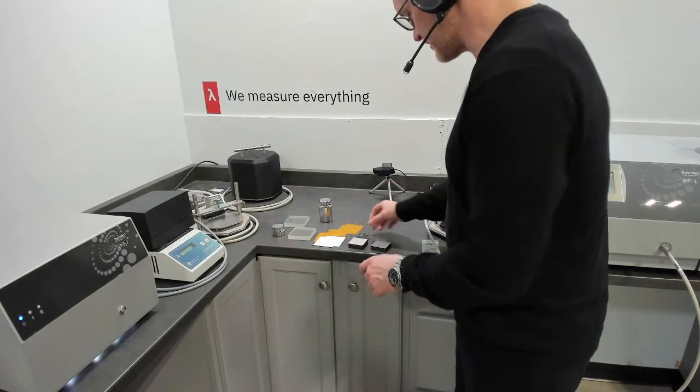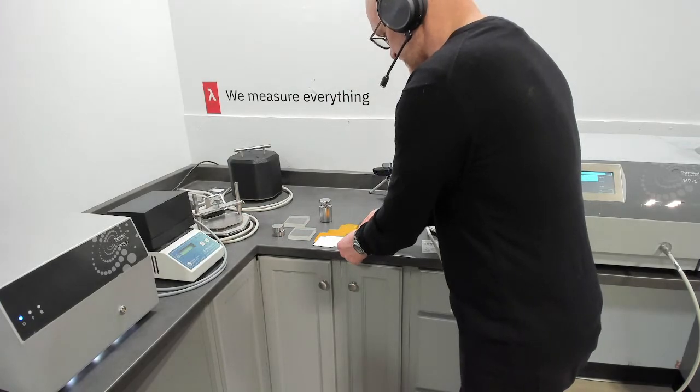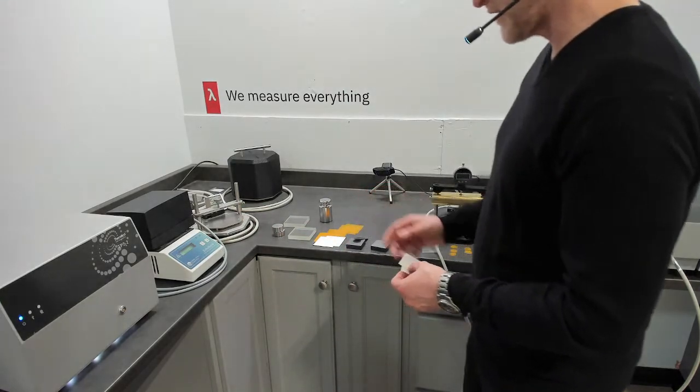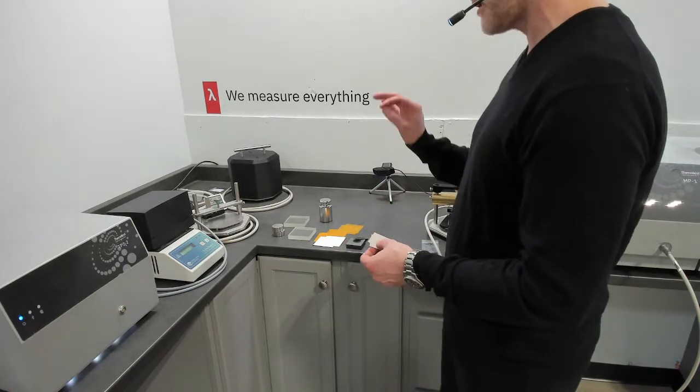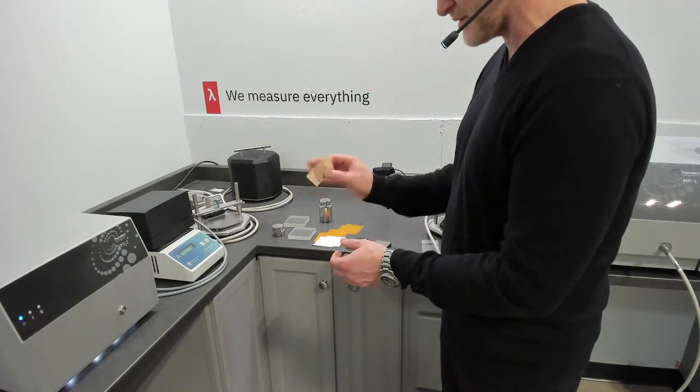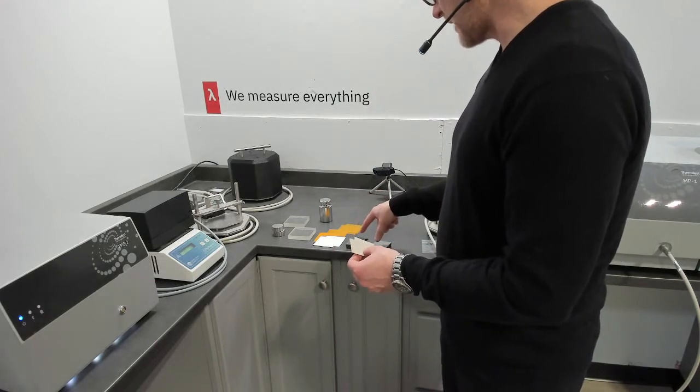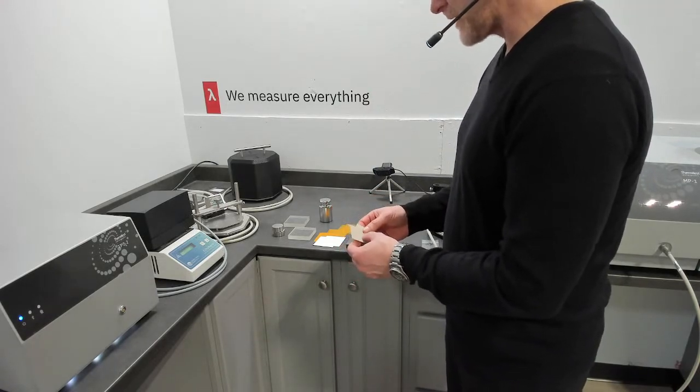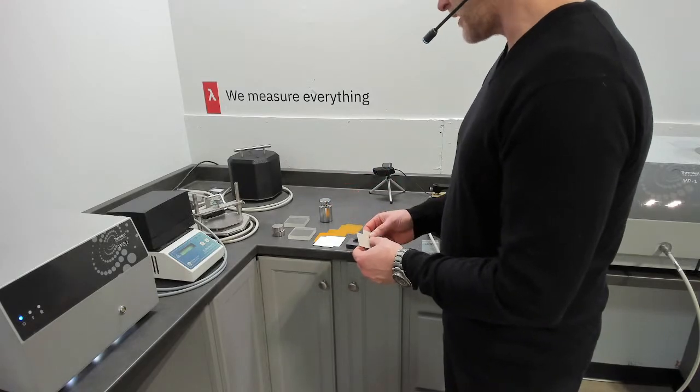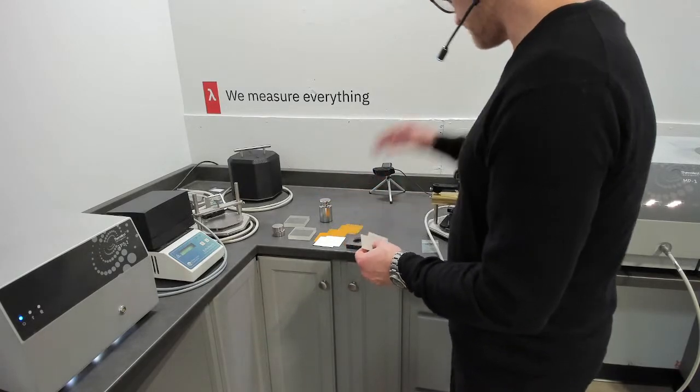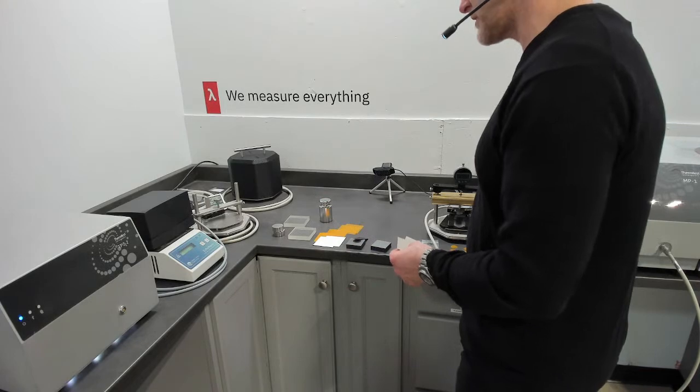So on the TPS2, the ability to measure slab would be limited to roughly around one watt per meter Kelvin as a conductivity range for measuring such materials. Thickness again, for the slab method, thickness range is sub millimeter. So maybe approaching 0.1 millimeter on the MP1, you can get down to 0.06 millimeter.